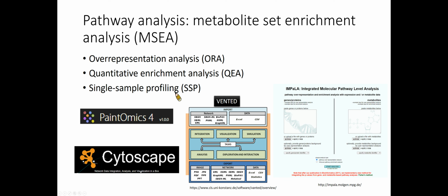From these input data, SSP identifies the set of metabolites showing levels significantly different from the normal concentration range. These are the MSEA tools for your reference.